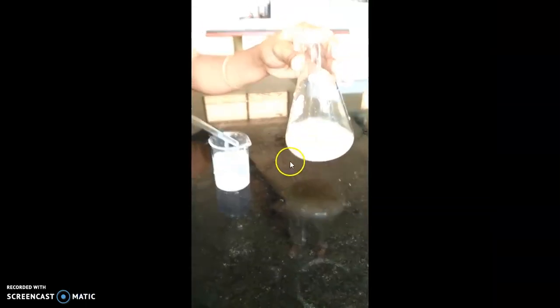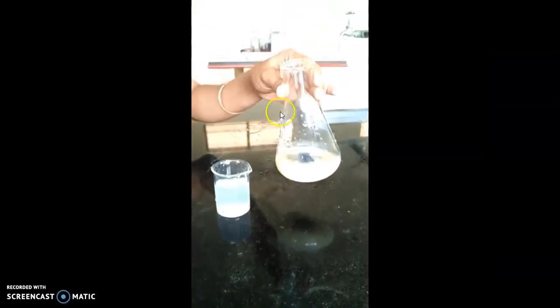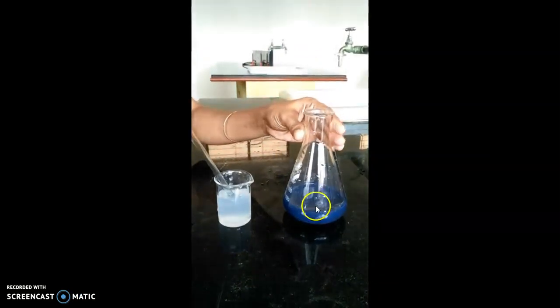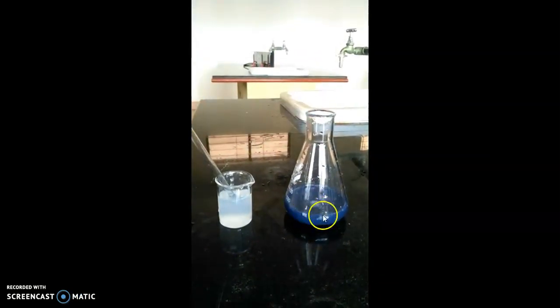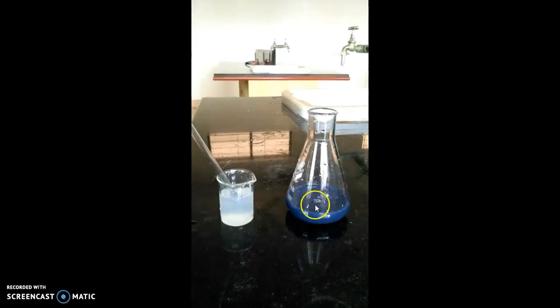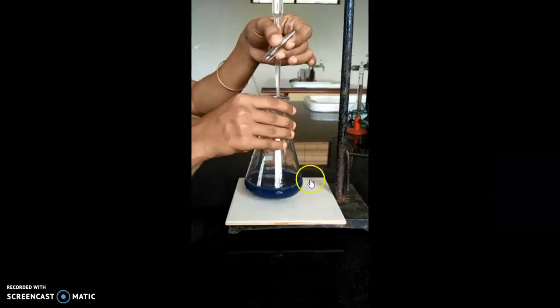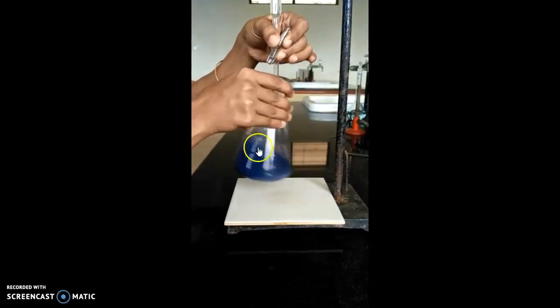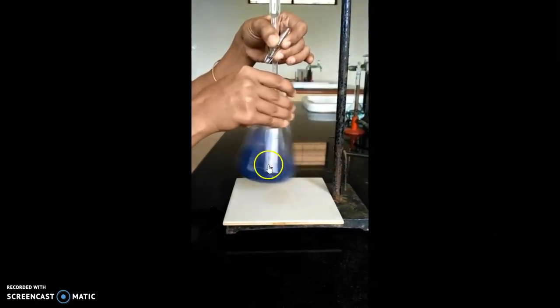Then, it has to be added. The starch has to be added and mixed well so that we can see the intense blue color formation. The deep blue color formation starts.